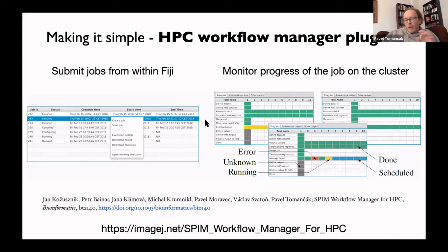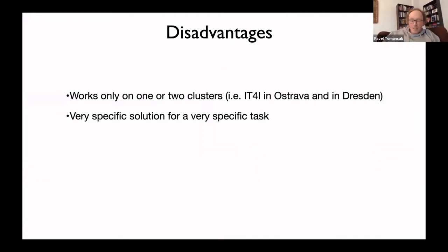So we developed all this, the ability to submit such a very specialized job to the cluster and to monitor how it progresses. And it is published if you want. And if you want to look at how it works, we have pretty decent documentation for all of this. But it has many disadvantages.